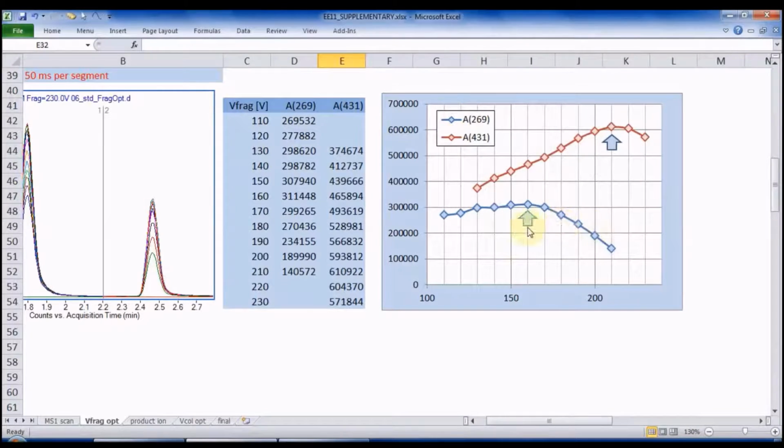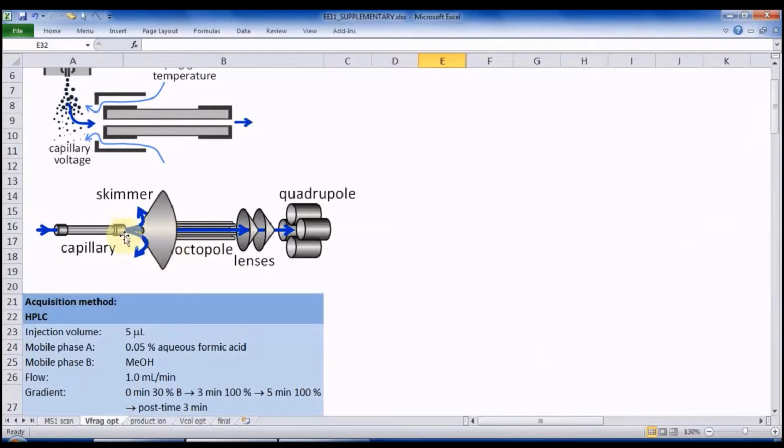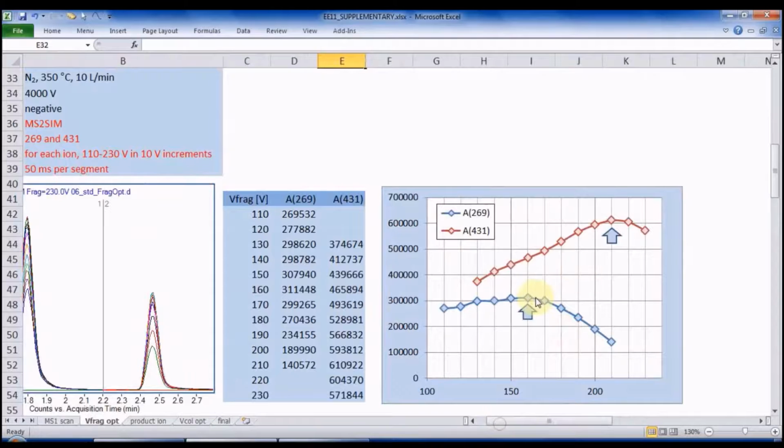Namely, as the voltage increases, the ions are accelerated to greater velocities. If the velocity is too low, the ions will easily be deflected by air molecules present in the fragmentor area and lost. At higher velocities, they will be able to push their way through and enter the high vacuum segment leading to the analyzer. However, at very high energies, collisions with air molecules can also result in ions receiving too much internal energy, which leads to their fragmentation and loss of sensitivity, as we can see here.